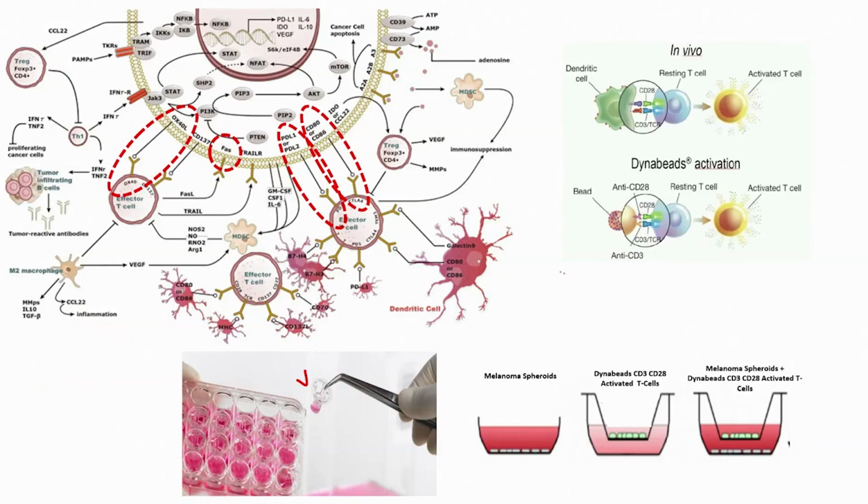It is a well with pores which are less than 4 microns. Now, I told you the T cell size is about 4 microns. So, T cells cannot pass through this filter, through this well. T cells cannot pass through it.